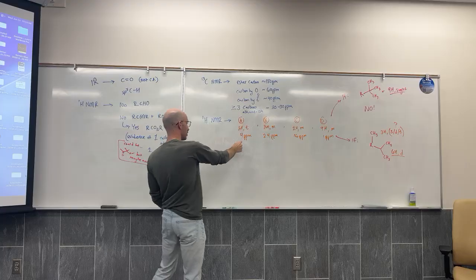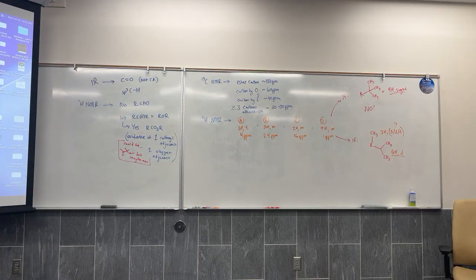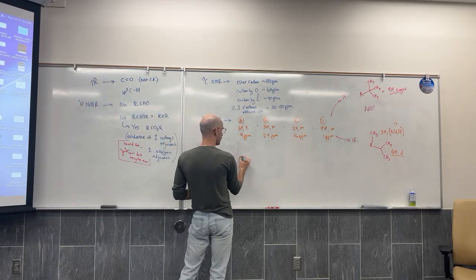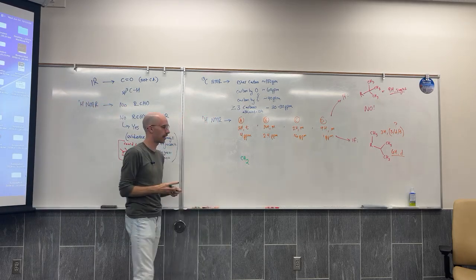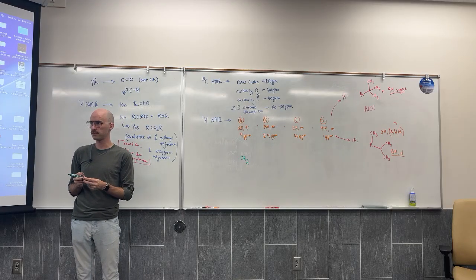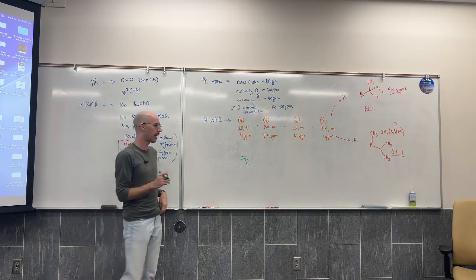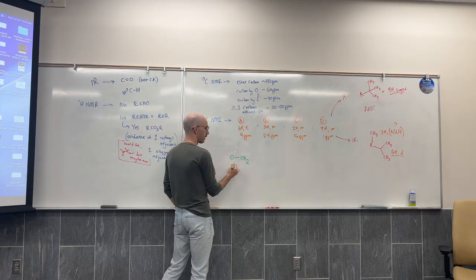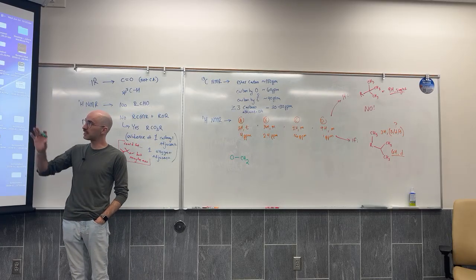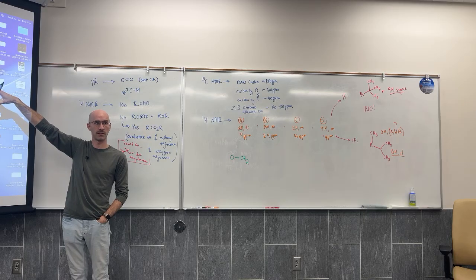All right, let's look back at some of our other ones because I think we can confirm them a little bit better. Around 4 ppm, I have a 2H triplet. So that's going to be a CH2 in my structure. Because of its chemical shift, I feel very confident that one side of it is an oxygen. Especially since I believe that there is an ester in this structure.